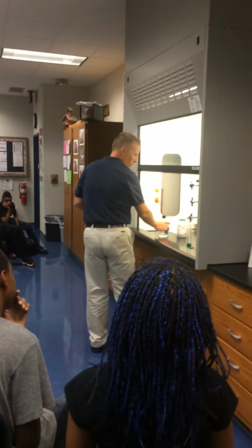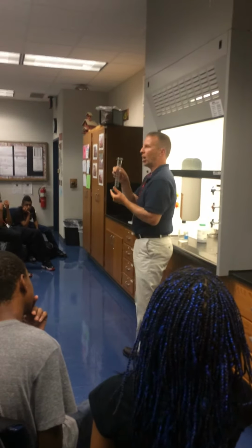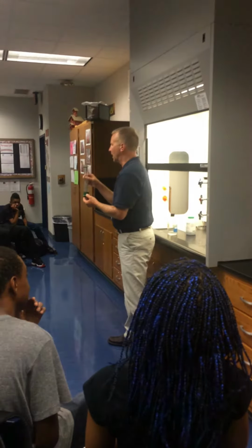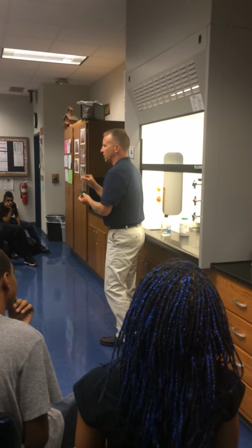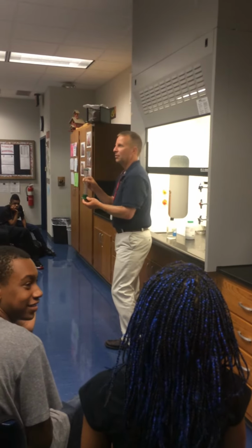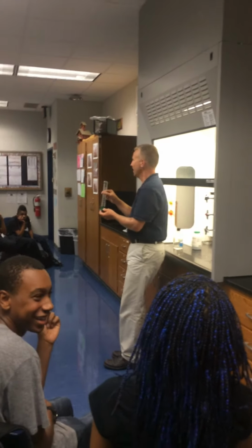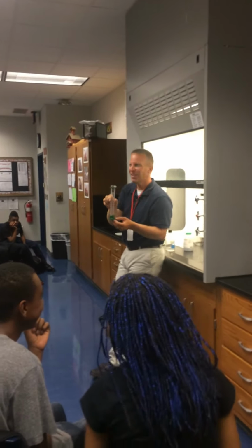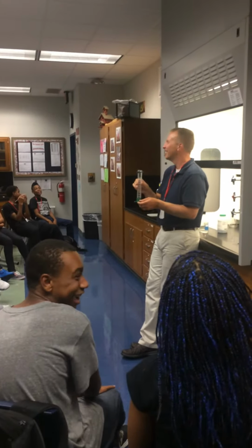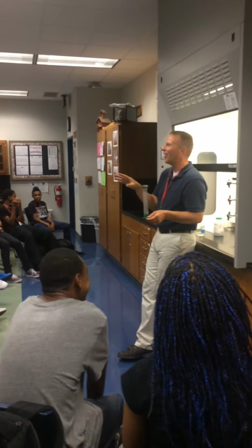What we're going to do is take and put that into a graduated cylinder. It is not a dropout cylinder, it's a graduated cylinder. Oh, wow. Hey, I'll be here all year.